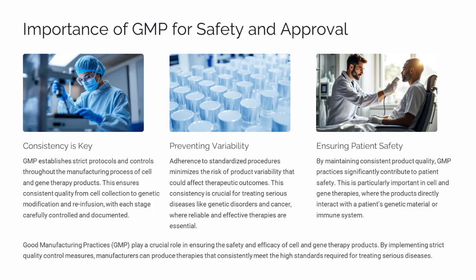The importance of GMP for safety and approval cannot be overstated. Consistency, preventing variability, and ensuring patient safety are key aspects. GMP practices ensure that cell and gene therapy products meet the highest standards of quality and efficacy.